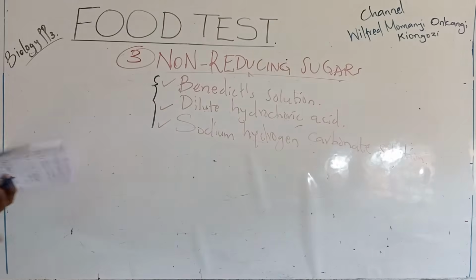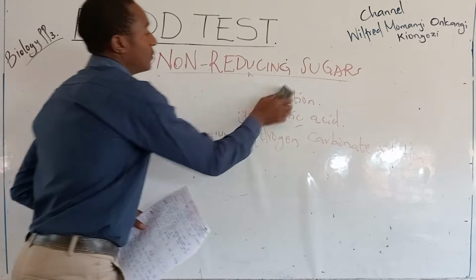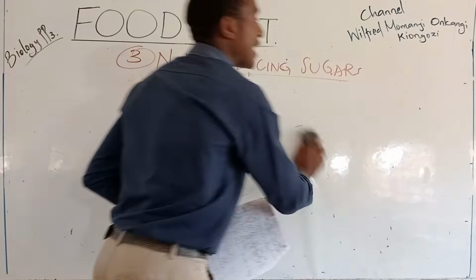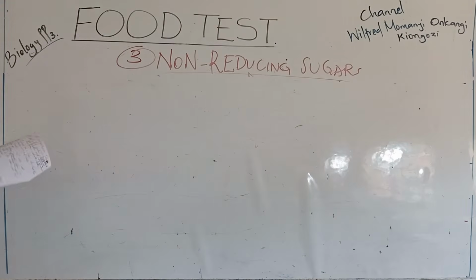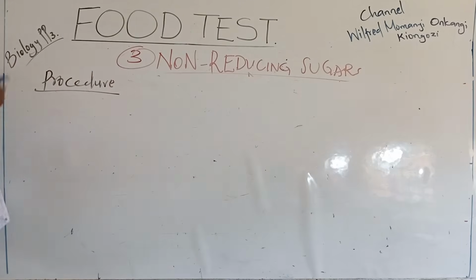The procedure for testing for non-reducing sugars.